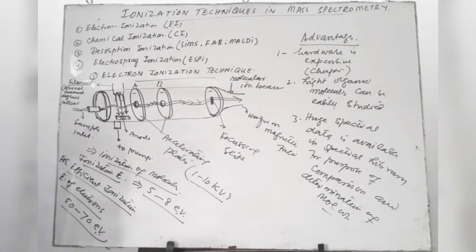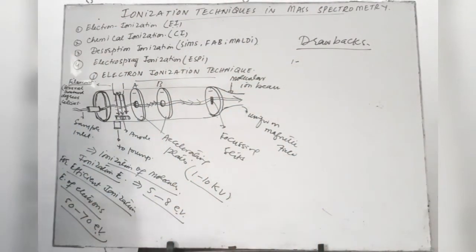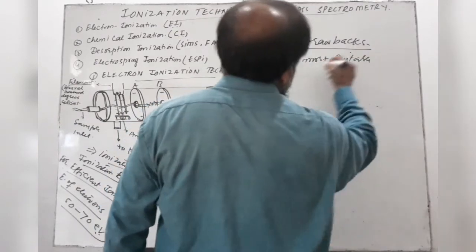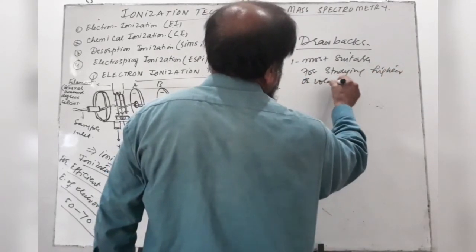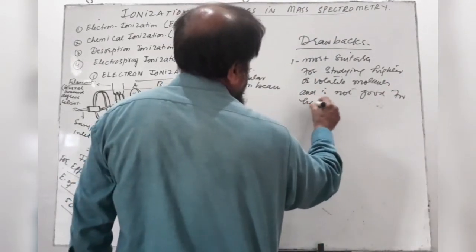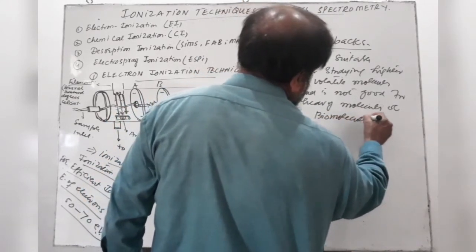There are a few drawbacks of this method also. Number one, this technique is most suitable for studying lighter or volatile molecules, and is not good for heavy molecules or biomolecules like proteins or carbohydrates.